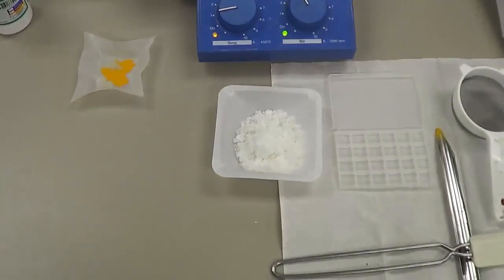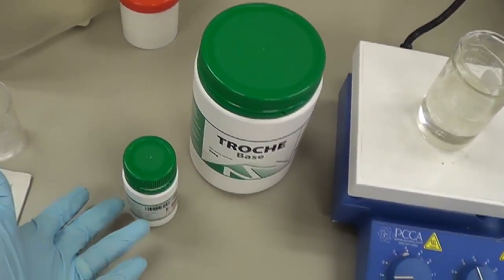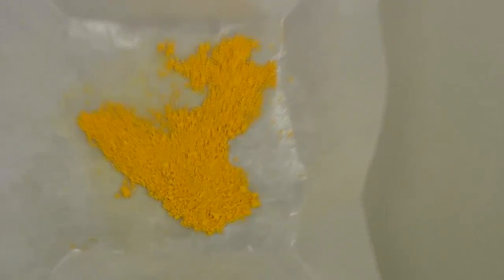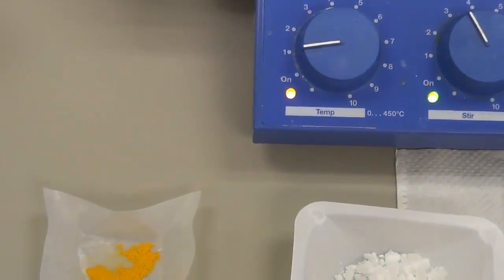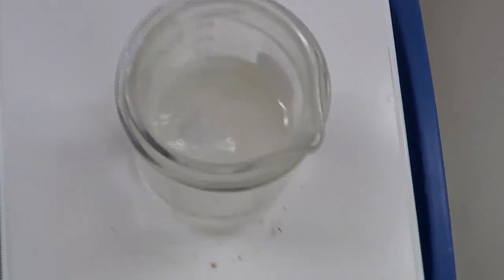What are the ingredients we can take today? One is the troche base and the other one is the active ingredient. The active ingredient which we have taken has particles that are not uniform in size. Can you see that the particles are not uniform in size here? If so, we have to triturate and sieve it directly. But the drug which we have taken is in very little quantity, so I would like to sieve the drug directly into my beaker.